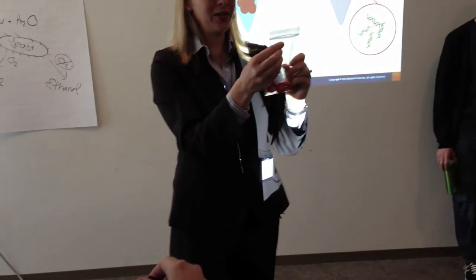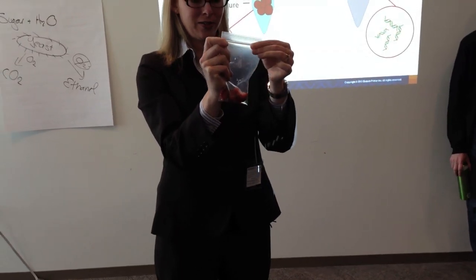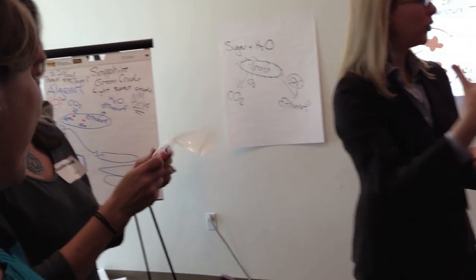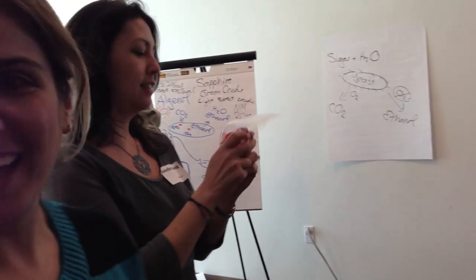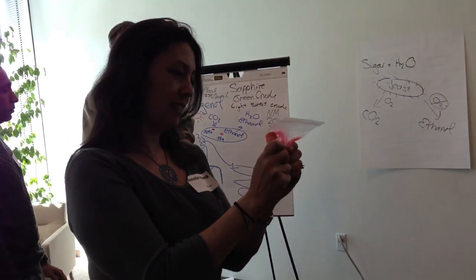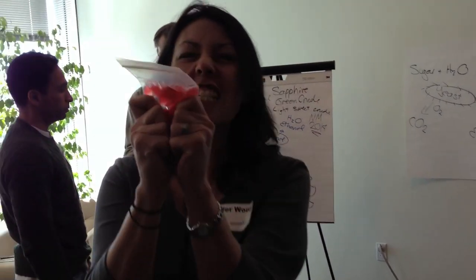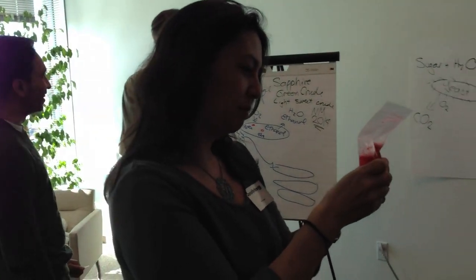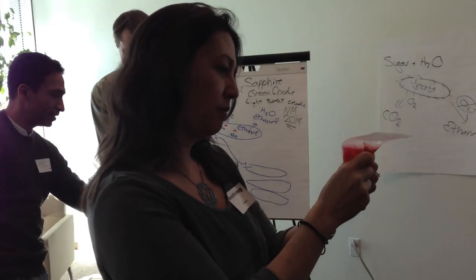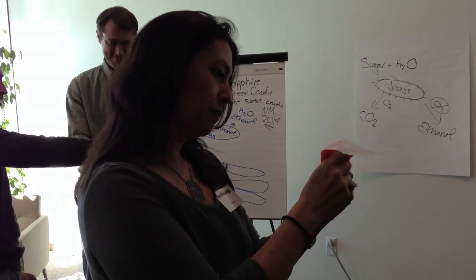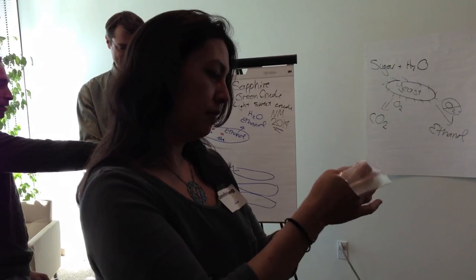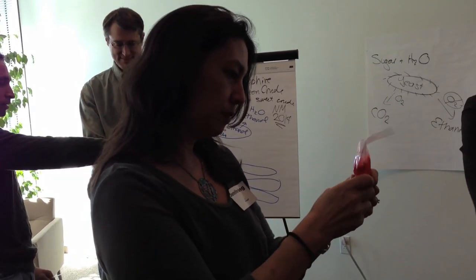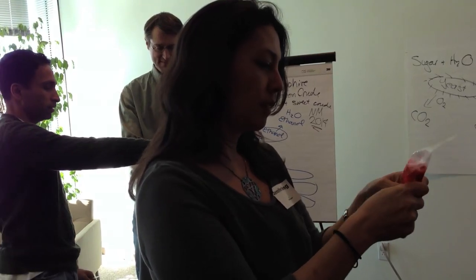Okay, now you can seal up the bag. Jennifer, you get to smash the strawberry. So we're using biofuel - use your own hands to go ahead and smash the strawberry. This is lysing the cell essentially. All we're doing, if you think about it, that strawberry has a bunch of connective tissue between all of the cells. We're breaking up that connective tissue, which is simply allowing the detergent to get into the cell membrane and break up each cell.